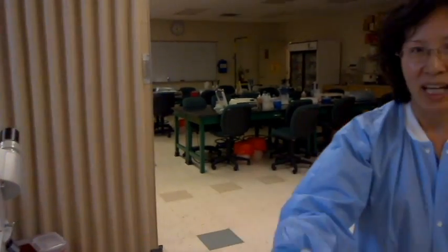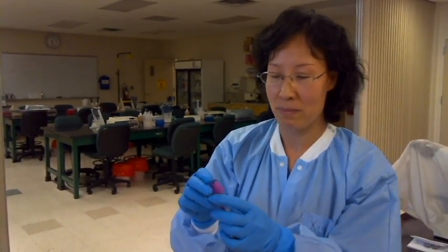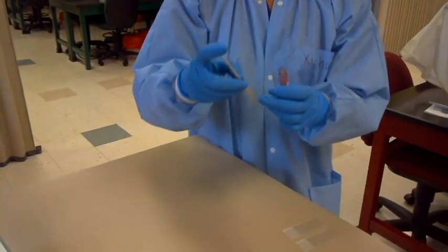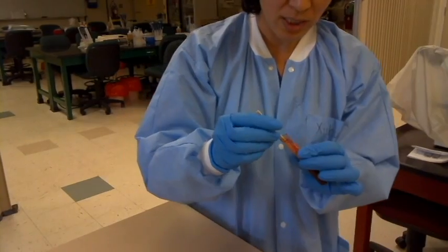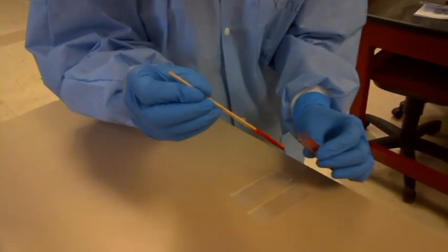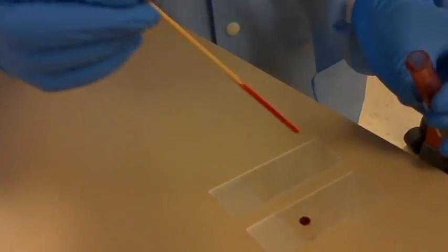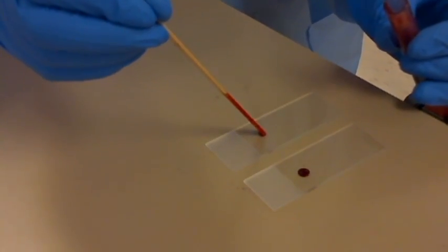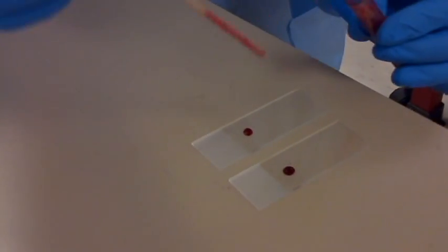So now we already have a blood sample. I'll show you how to make a smear — it's not easy to make a smear. First, we use two sticks to take out blood and put it on the slide. The drop shouldn't be too big or too small. This one is too small, so I'll add a little bit.